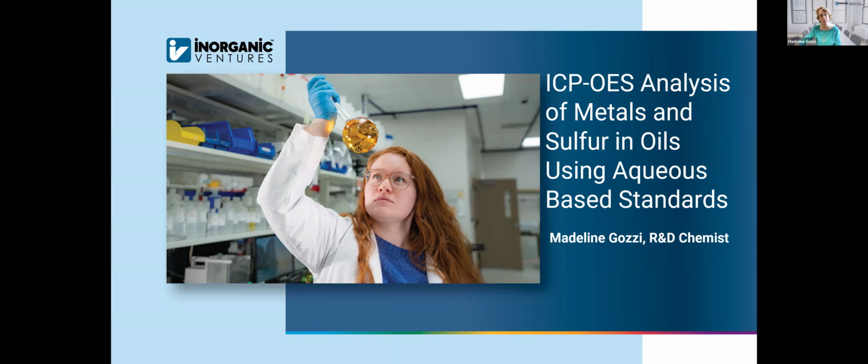Today, I'm going to be telling you about our development of our hybrid aqueous organic solvent standards that are used for testing metals in oils by ICP-OES.